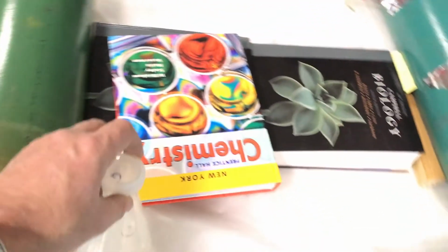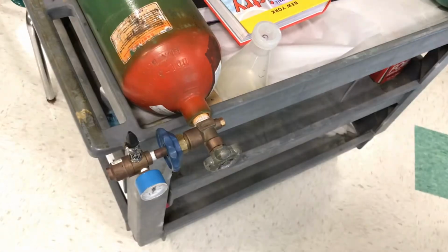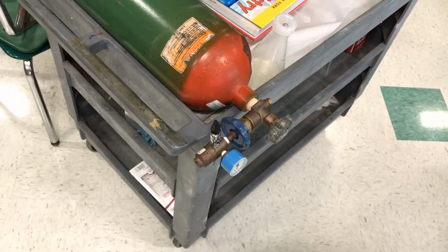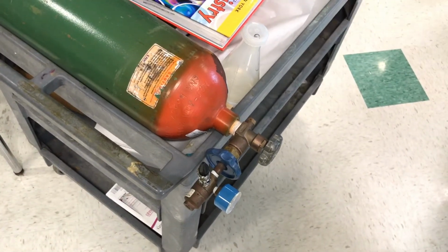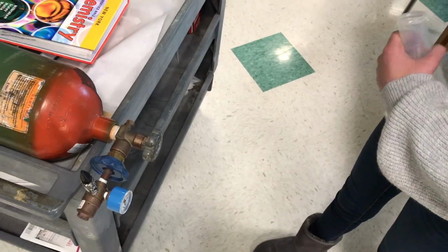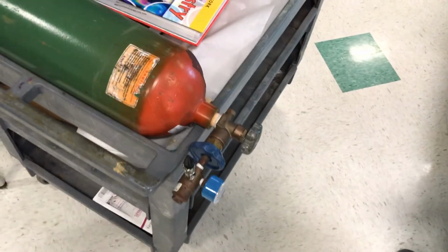Now we're going to take this container over and we're going to do our first gas. Now this gas is lighter than air. So student E, why don't you come over? You gonna trust me? No, but we're going to have to. Okay, so grab it. Take the top off. Show the fans at home taking the top off. Good. Now, what you have is a balloon valve here.